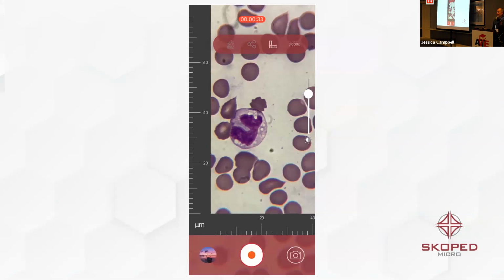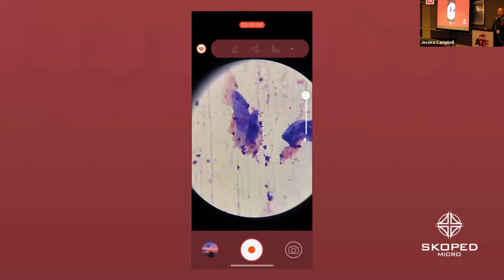No, I'm like, okay, you don't get to say anymore. So this dog is actually Ehrlichia positive. When we first took these pictures, we were trying to differentiate whether these were morula or vacuoles. You see these right here. I really wanted to make that a morula really bad. I actually posted it, and my buddy Kate Baker shot me down. She said, take that off, you don't know what you're talking about. Some friends are great, aren't they?